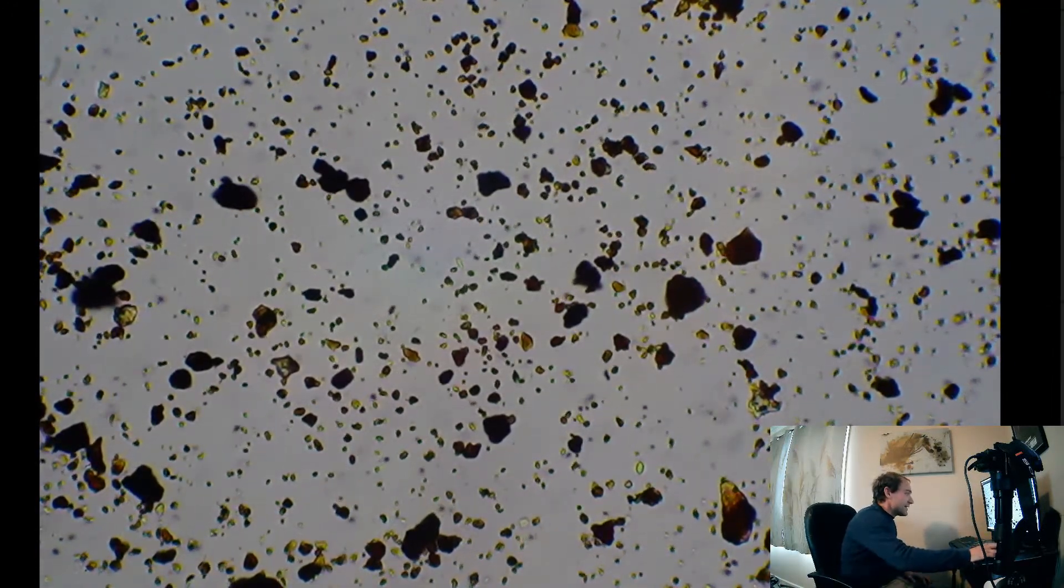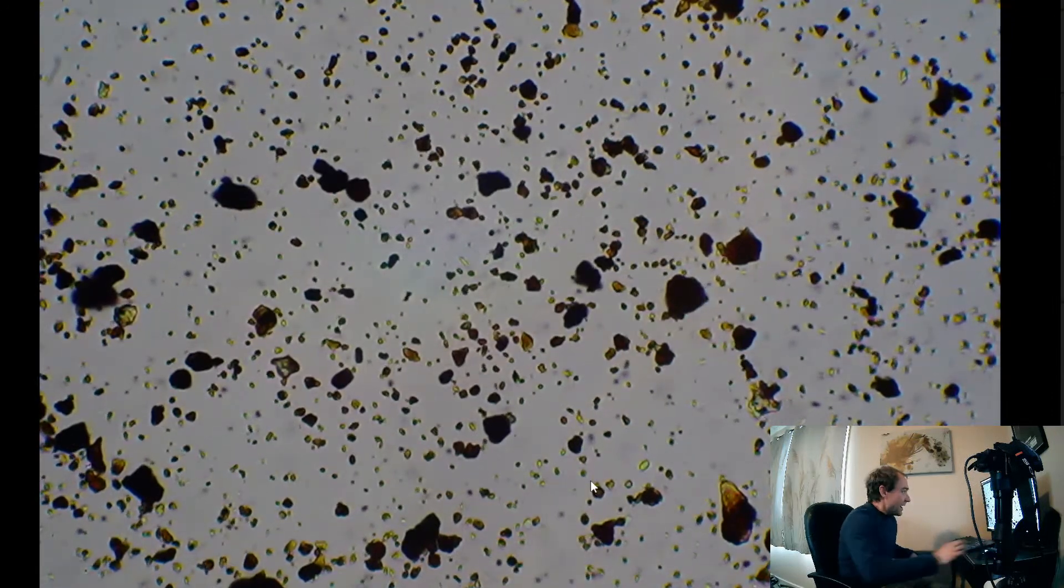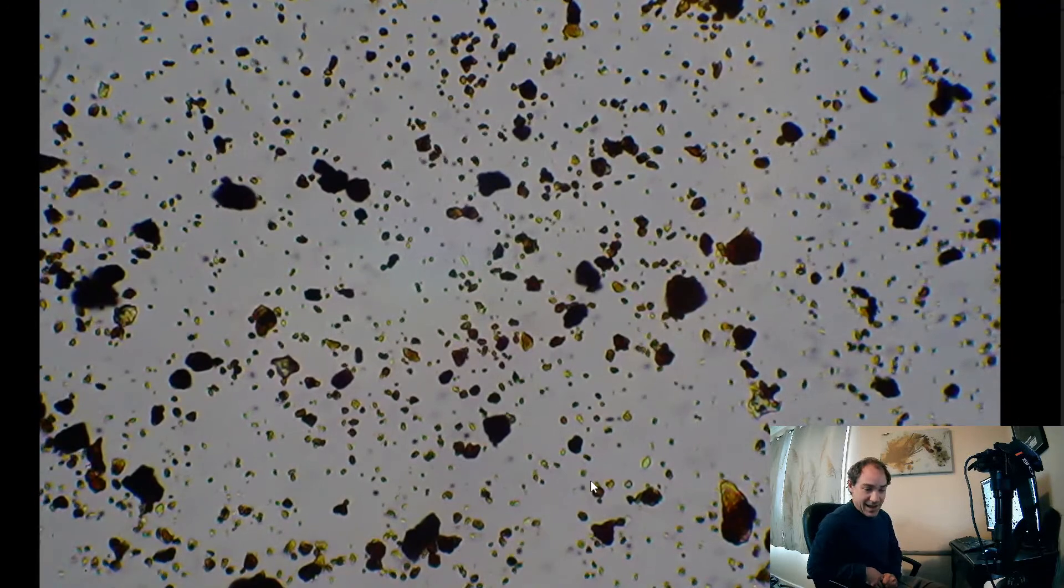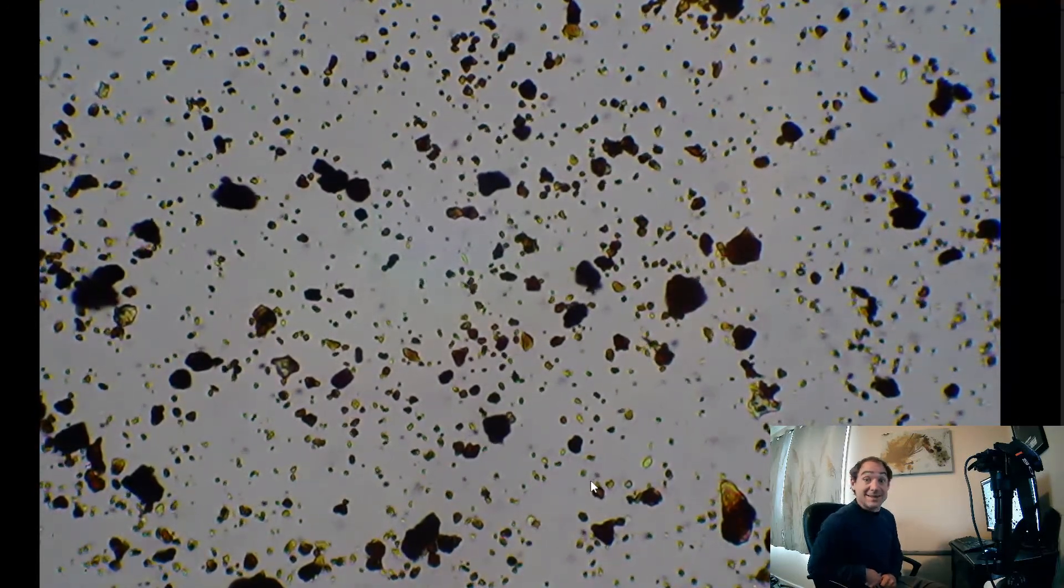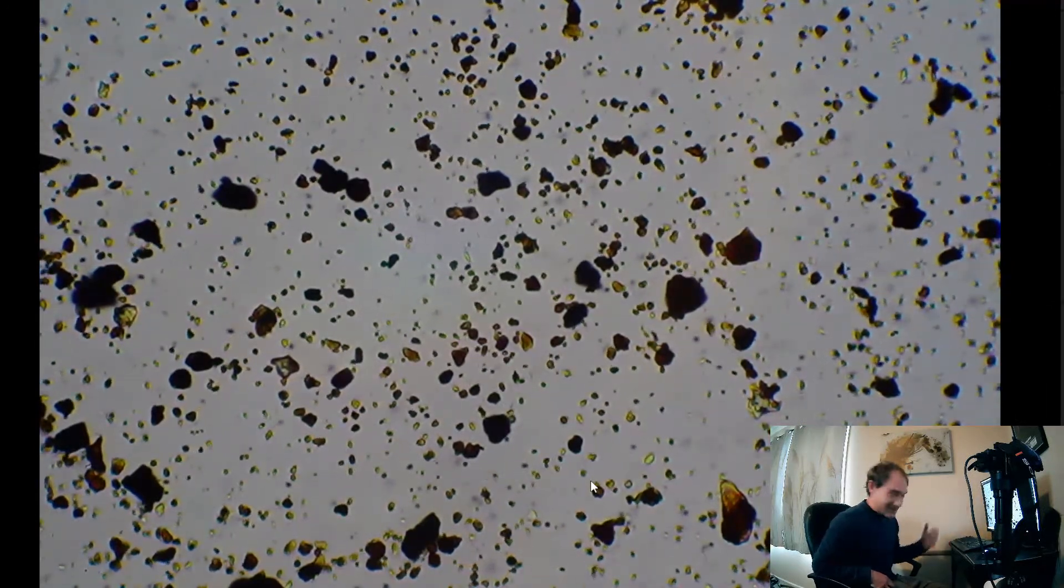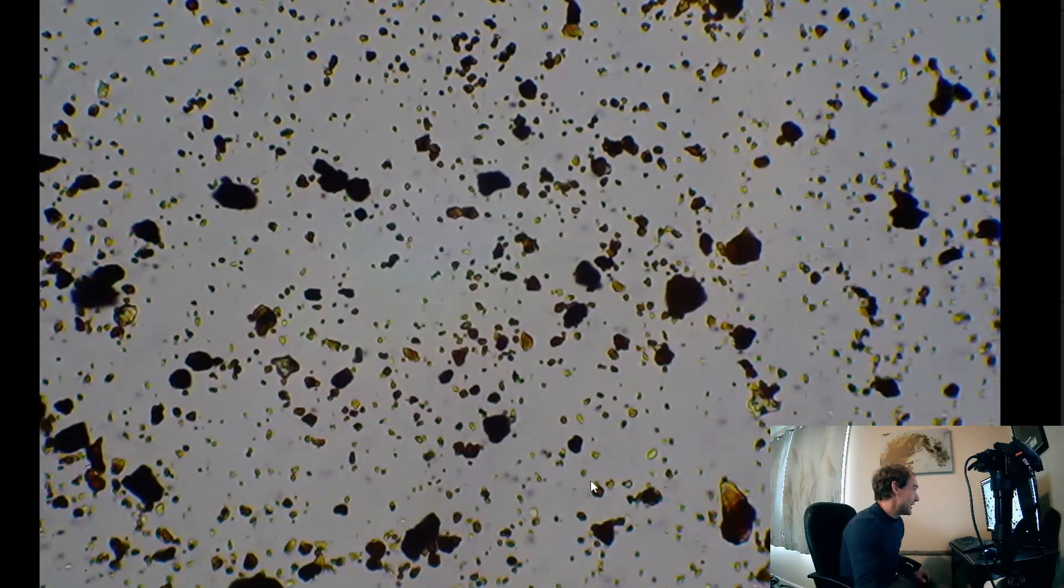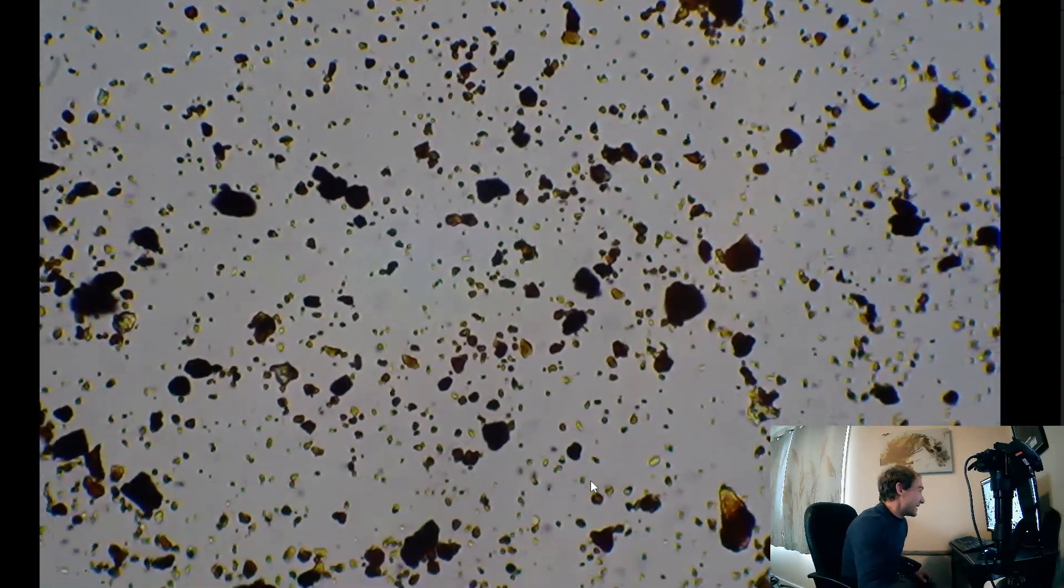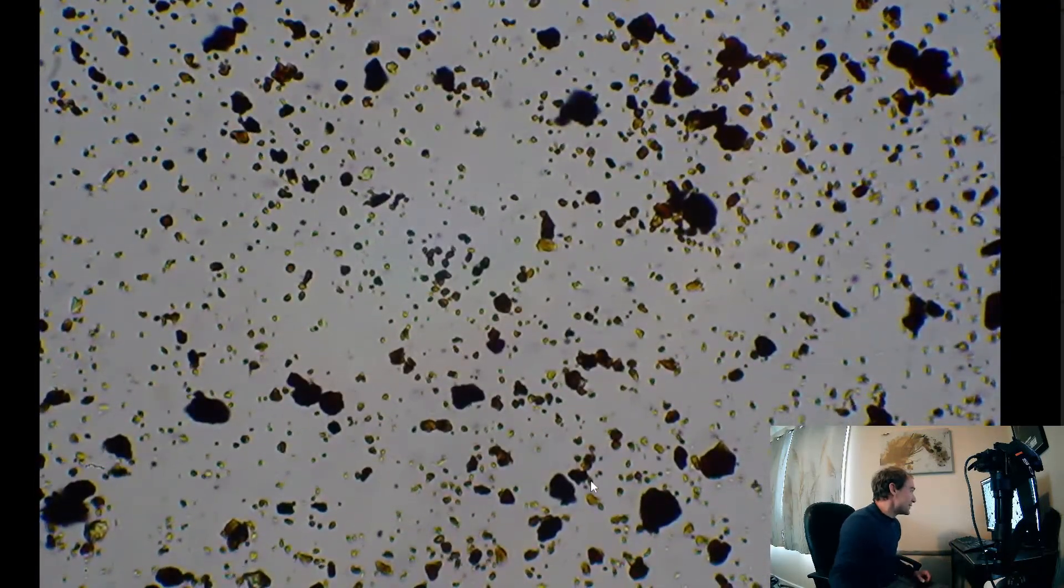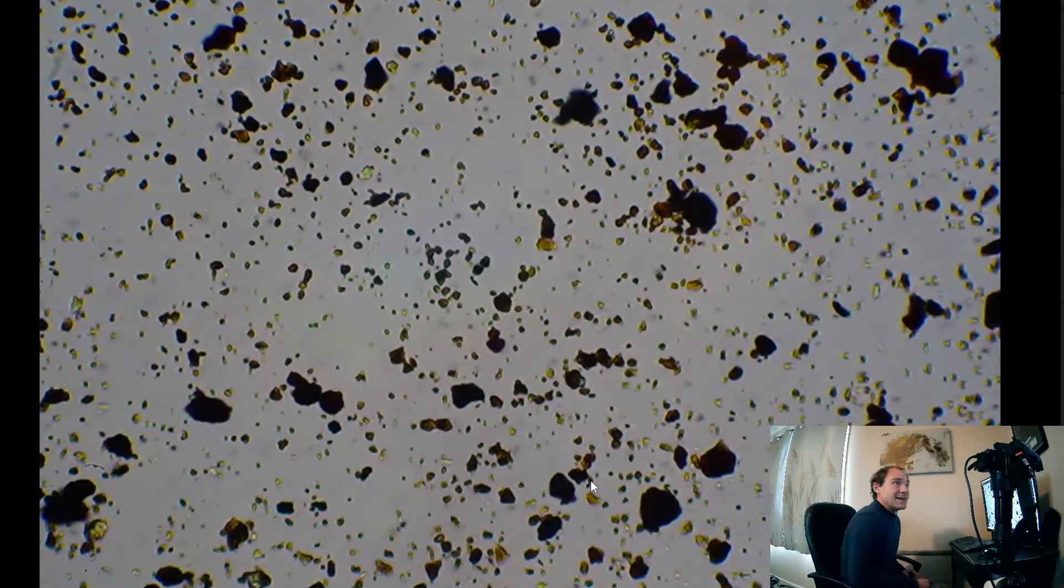We're seeing, waiting for things to start slowing down here. I had to remix and dilute more because this stuff is really thick. I threw it on there and you couldn't see anything, barely any light was getting through. Just putting one pure drop of the rejuvenate on the slide, so we had to dilute a whole bunch of water to a few drops and this is what we're seeing.